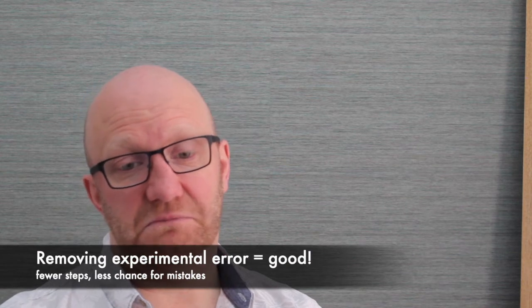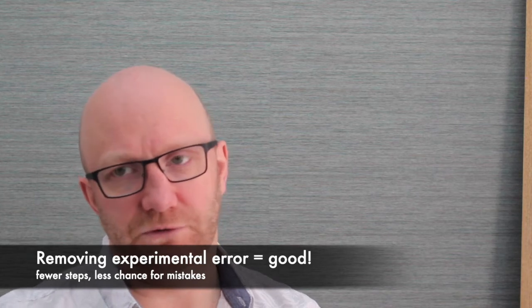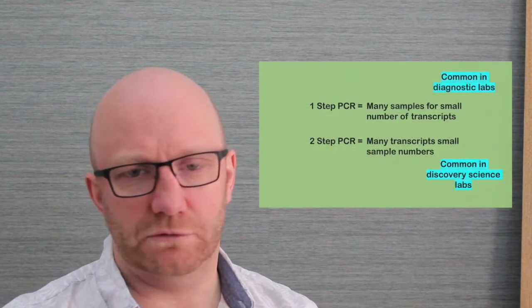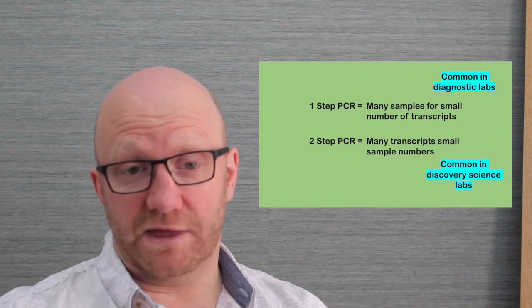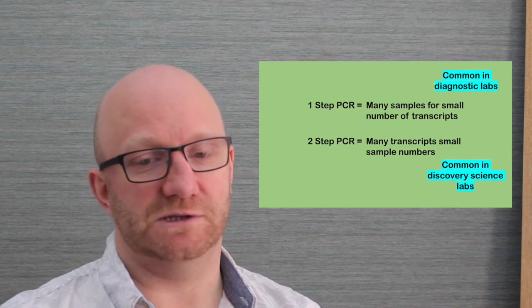However, you can get a more accurate representation of the target copy number. There are fewer steps along the way, fewer pipetting errors, and basically less chance of contamination or other mess-ups along the way. You're doing fewer interventions. So one-step RT-PCR is definitely the way to go if you are screening many samples but only for a small number of genes, perhaps under 4. And for that reason, you find one-step PCR used very widely in diagnostic situations.